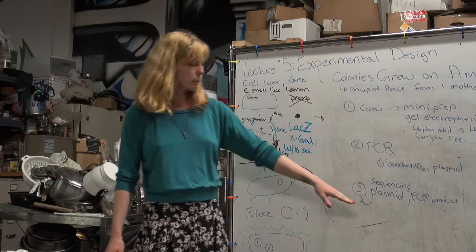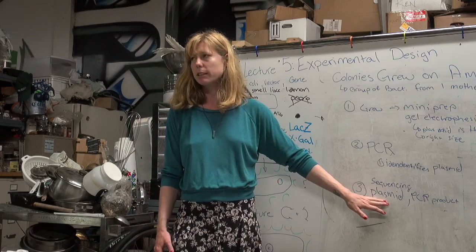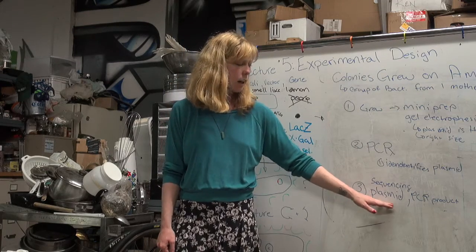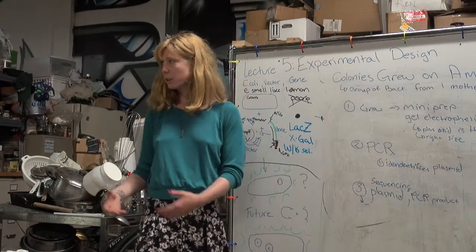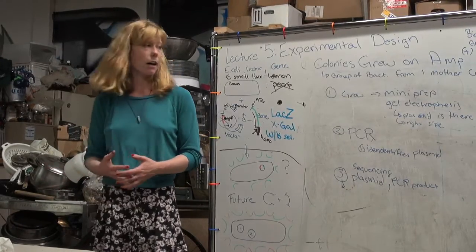But generally, for a plasmid, you can just use their in-house primers. There are some pretty promiscuous primers out there that will work on almost any sequence. Then they'll send you back a sequence and you can compare how it looks to what you'd expect.